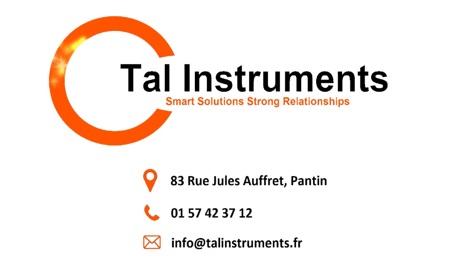Now that you have successfully completed your PQ-Cal, you can begin to use your Polymax Plastics Analyzer.